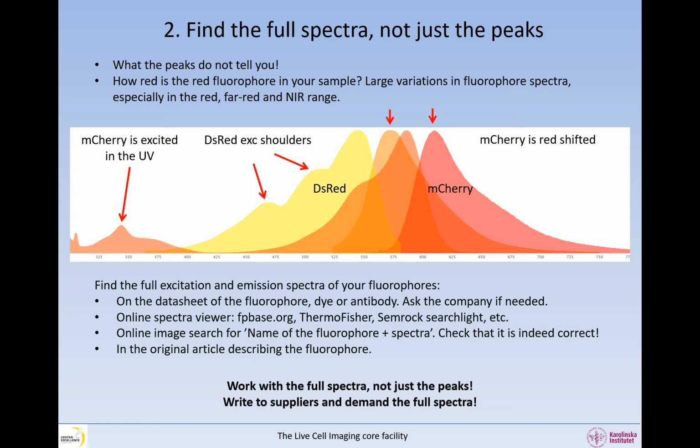So work with the full spectra, not just with the peaks, and write to suppliers and demand the full spectra. It is not possible to evaluate bleed-through if you do not have the full spectra, so tell them that they have to give it to you.